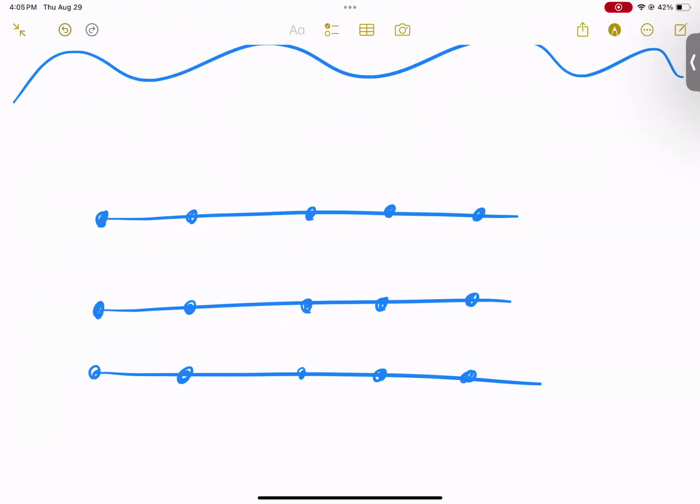And what happens is that once we shoot X-ray onto a crystal plane, we get specular reflection. So specular reflection looks a little something like this. So we have the X-ray coming over there, and it will reflect off this way. It'll come at a certain angle, theta, and it'll reflect at the exact same angle, theta.